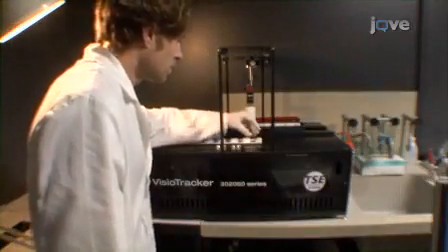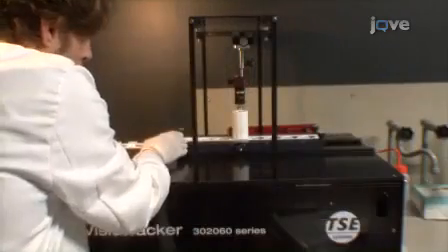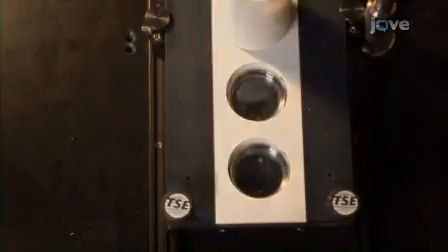The system includes an immobilizing device for small fish positioned under a high-quality video camera equipped with a zoom lens.